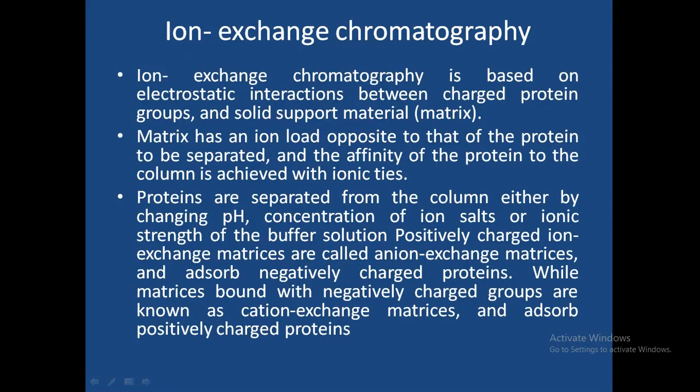Then, what is the principle behind ion exchange chromatography? Ion exchange chromatography is based on the electrostatic interaction between the charged protein groups and solid support materials. Here, the stationary phase has to be coated with the ion exchange resins. So, the ion exchange resins are going to be used for the separation actually.